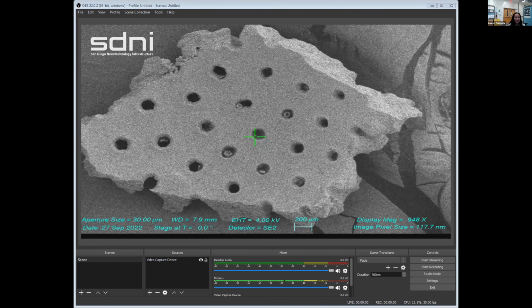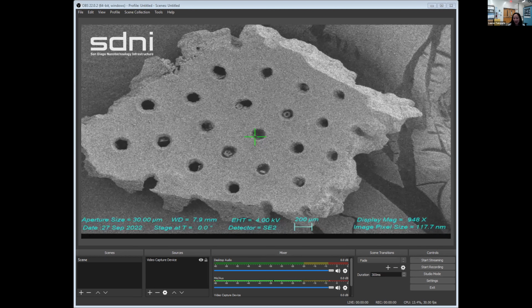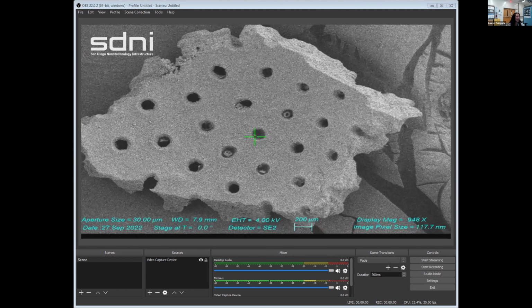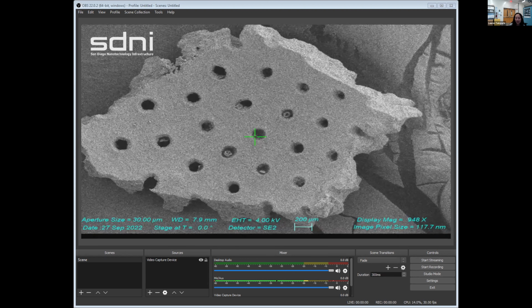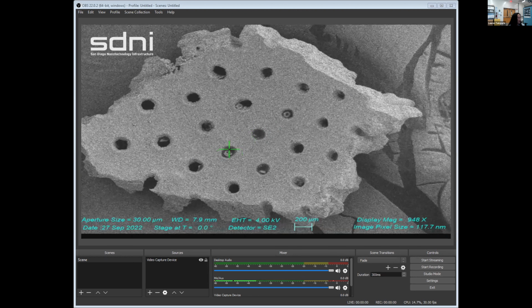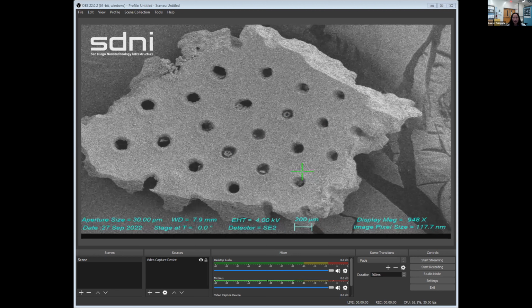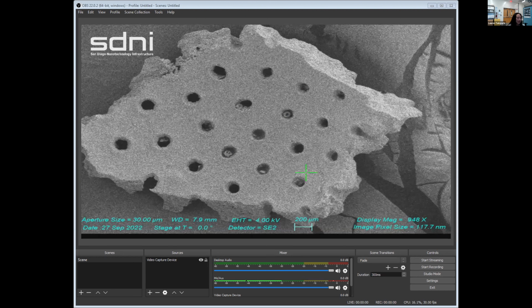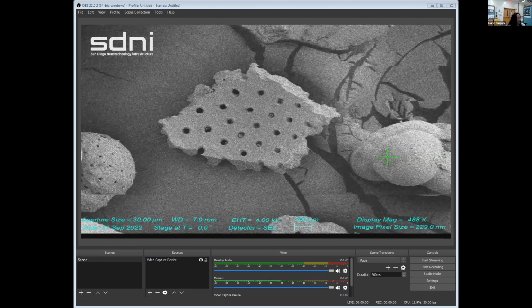Okay, so this is very different from the spiky shelled friend. And these things are really cool because they often have perfect geometric form and symmetry, like for this one, the holes that are there. And it appears that it was broken off of some other piece, but yeah. Notice the symmetry of the other shells that we'll go to.